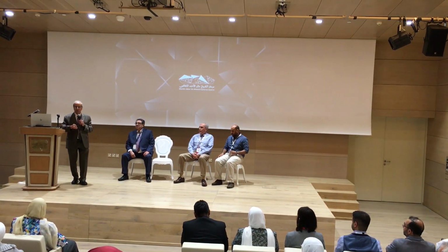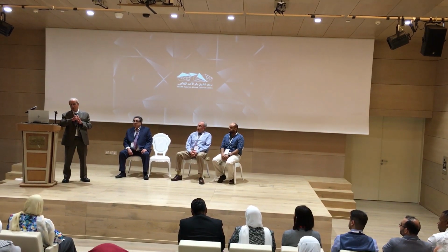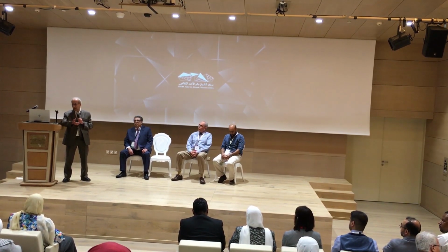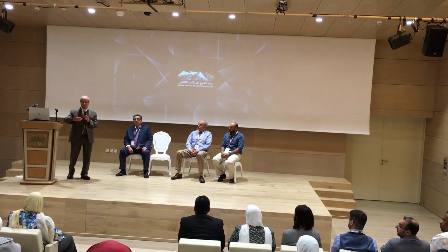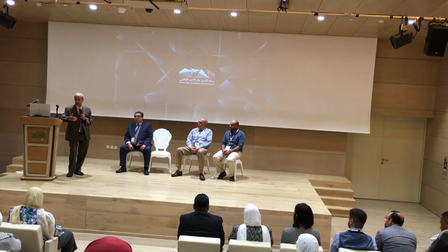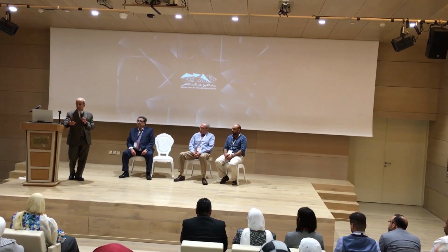What I'm going to try to do is just illustrate to you the process of CAP inspection. Some of you have been through that, but probably many of you haven't. So we will start from the beginning. One of your colleagues asked Dr. Hand to tell you exactly how to get started with the process. The process starts with looking at what you are doing.